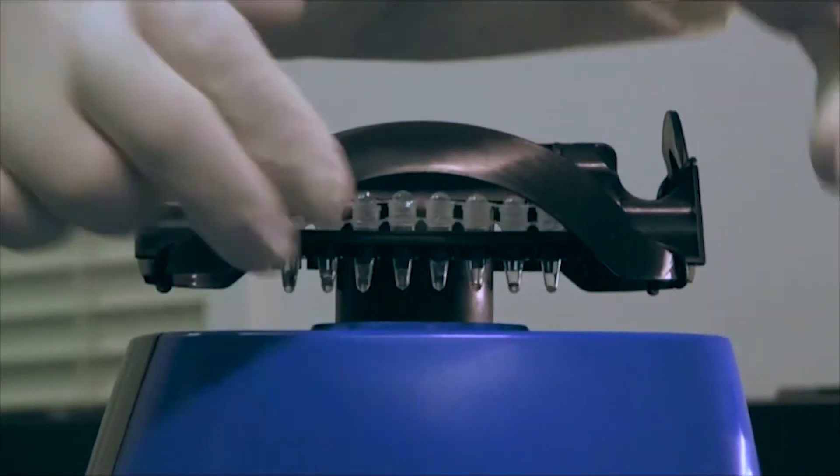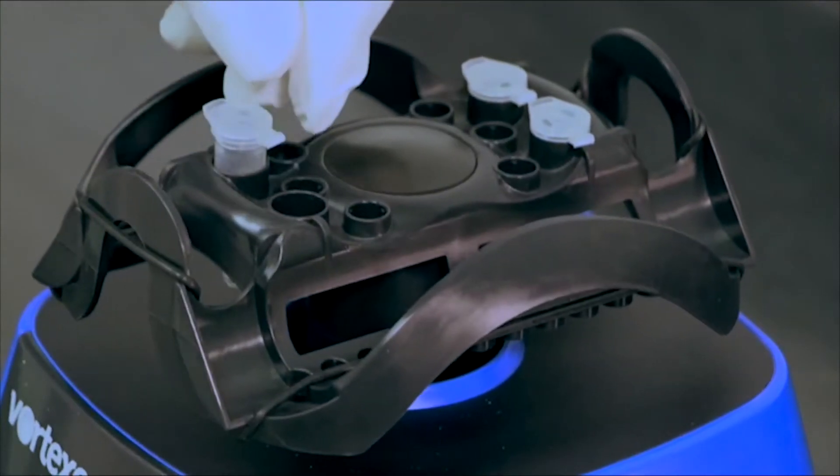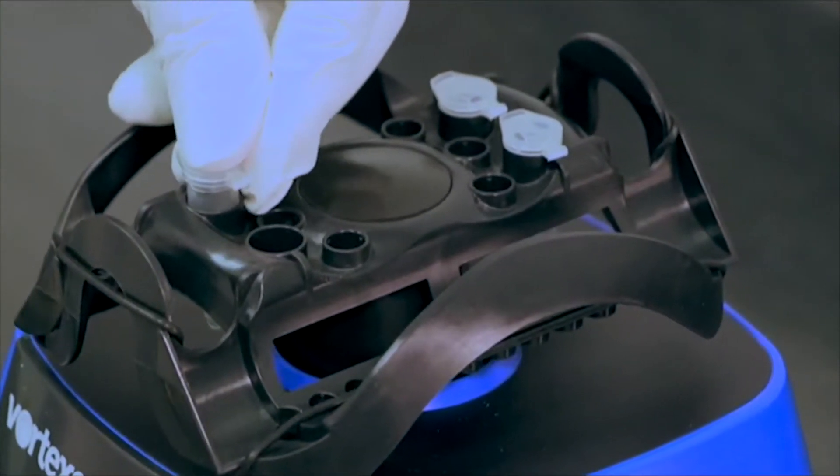But with the Vortexer, the head stays on and researchers can perform several applications in a single mixing platform.